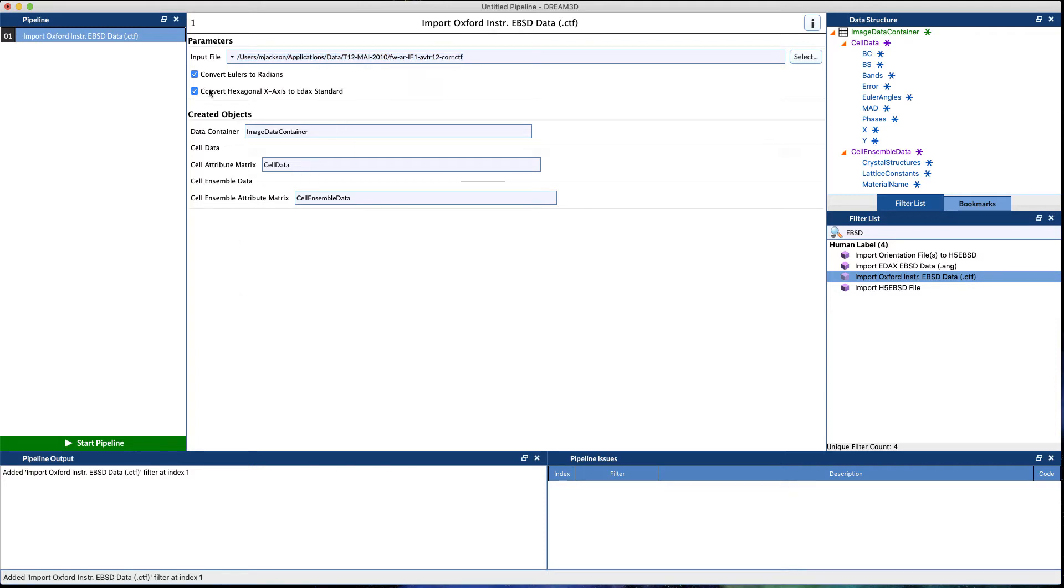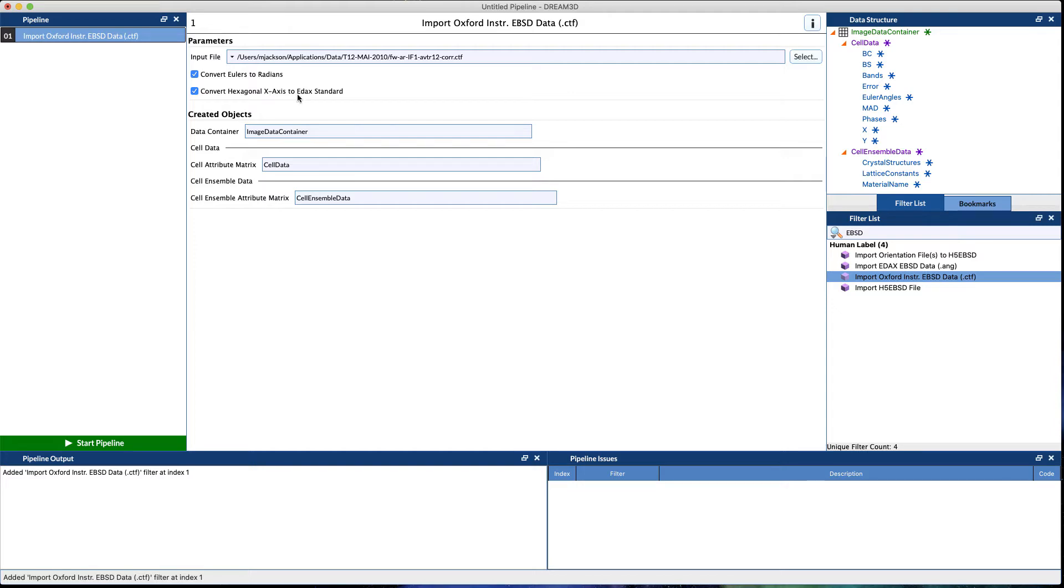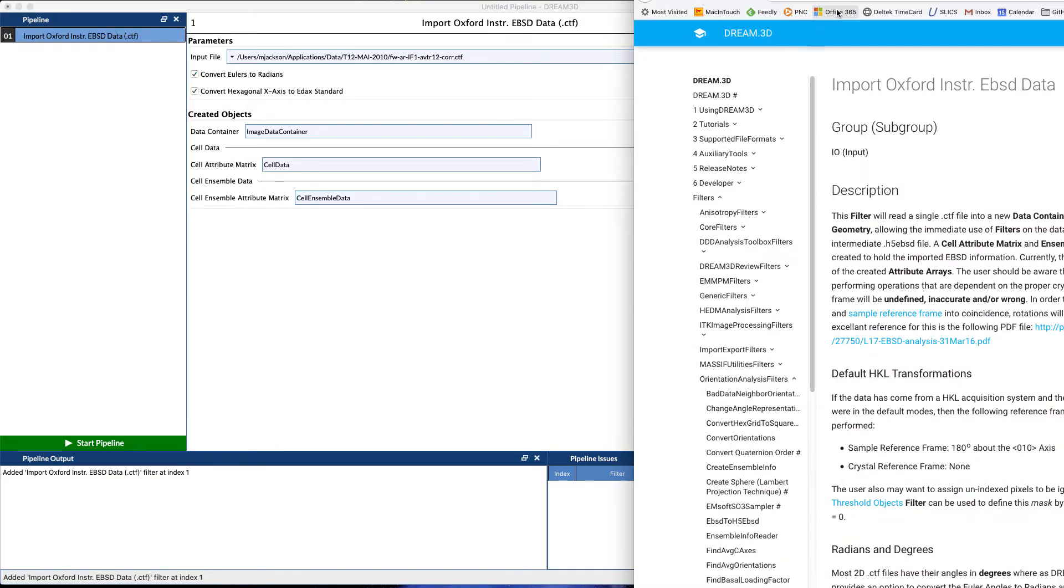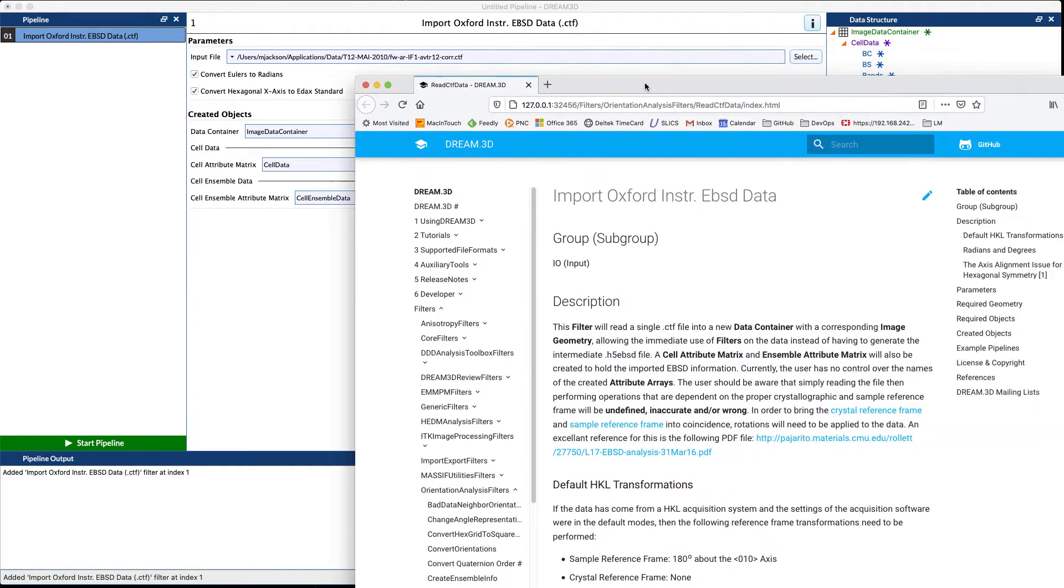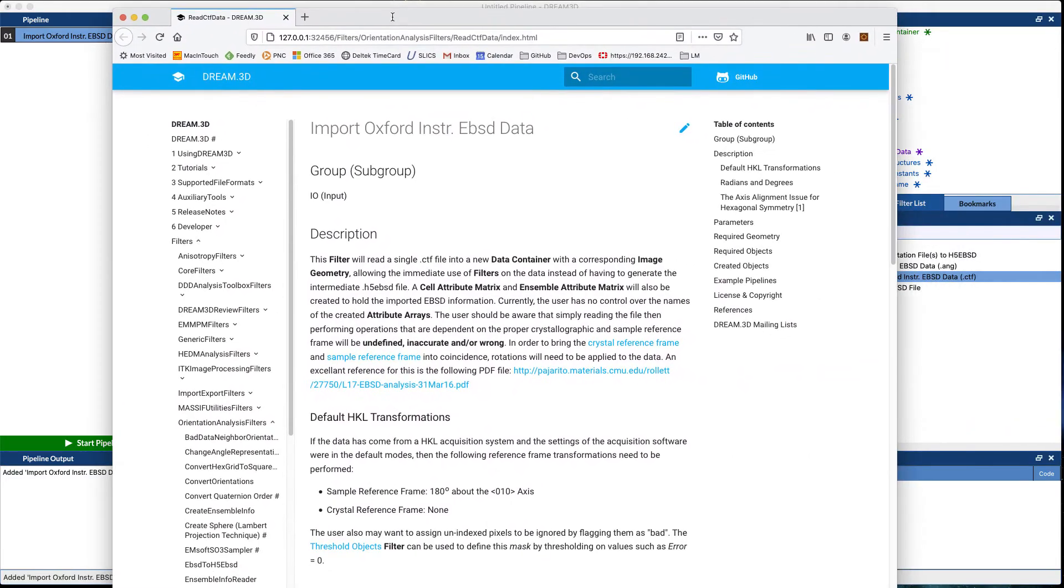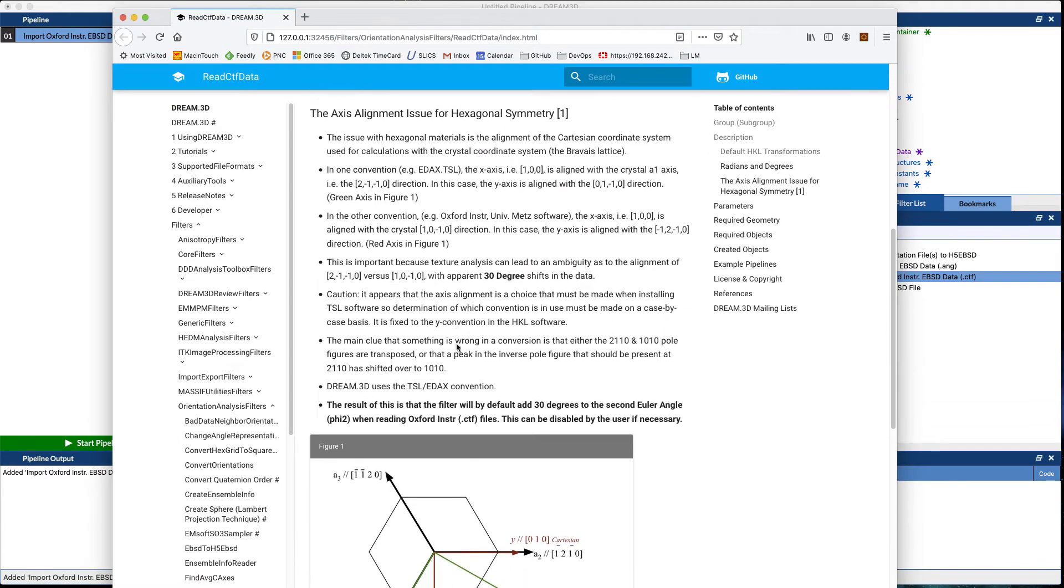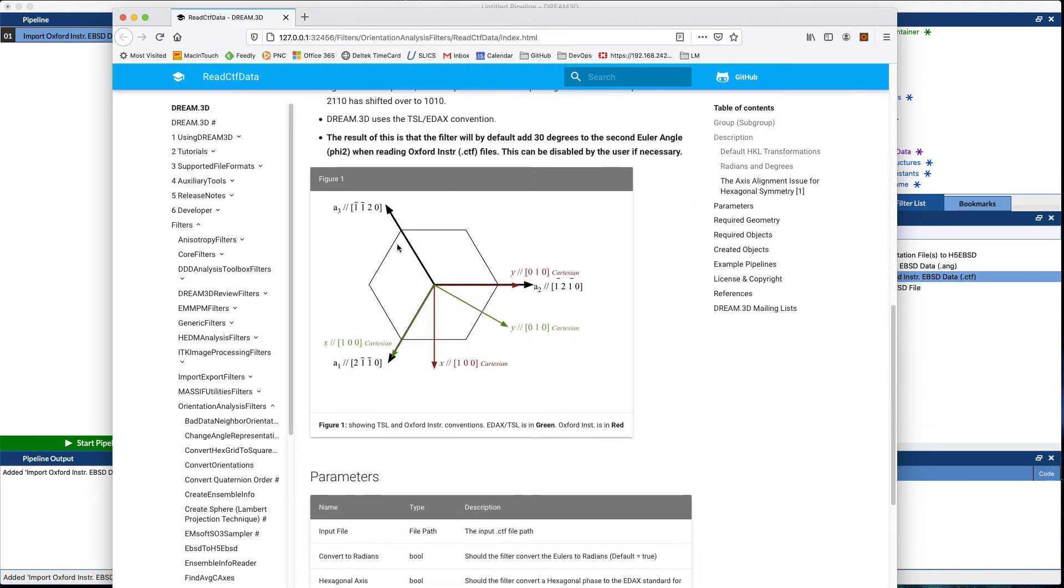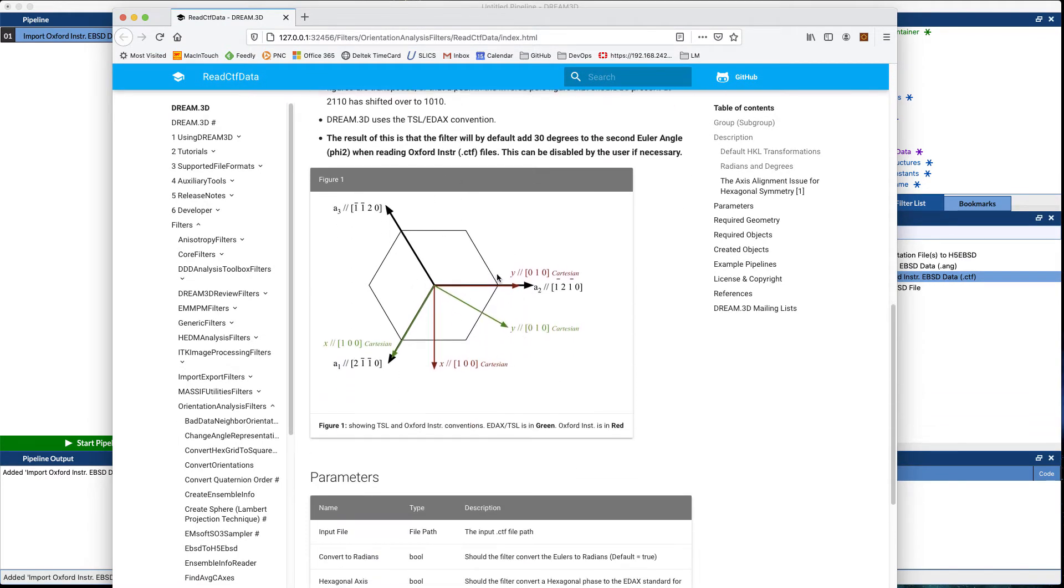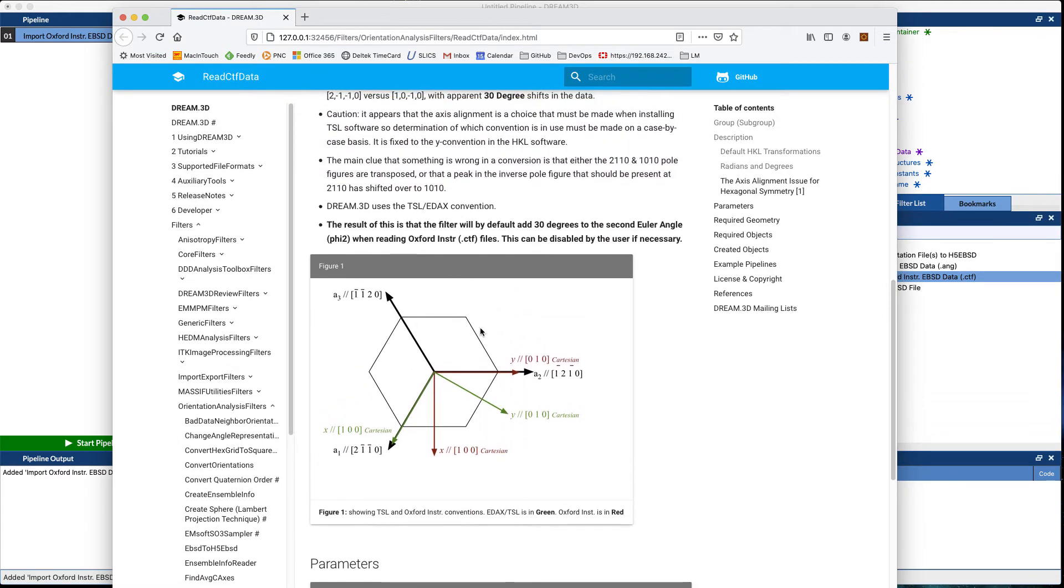For data that has a hexagonal crystal structure, you'll want to check this checkbox which is on by default. That will auto-convert from Oxford Instruments standard over to the EDAX standard which Dream3D uses. If you want more information, you can click the information button and scroll down in this filter for a short explanation on why you would or would not want to.